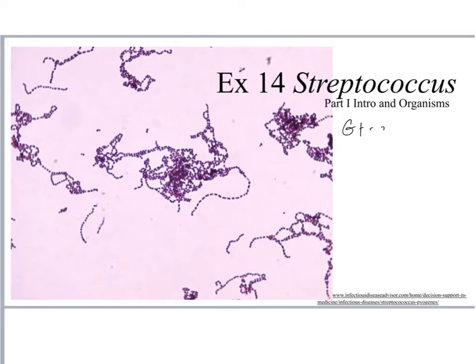They are more often going to be arranged in chains. And that's not always obvious. Some streps make these beautiful long chains. Some streps only pair up, what we would call diplococci. But if you see, again, these long chains, that's a pretty good hint that you have a streptococcus of some kind.